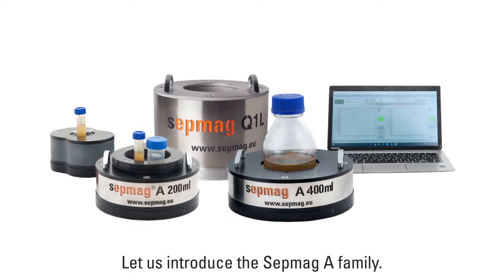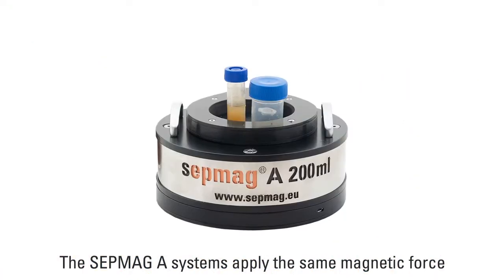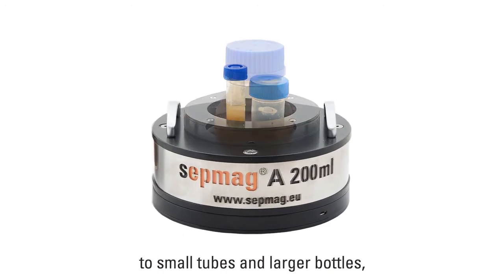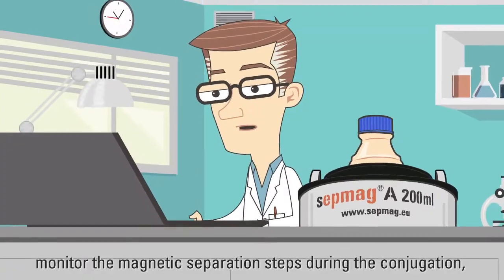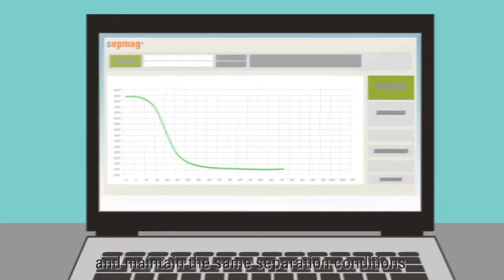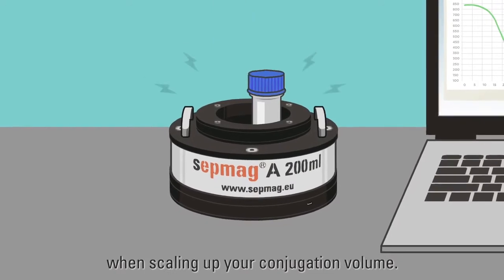Let us introduce the SEPMAG A family. The SEPMAG A systems apply the same magnetic force to small tubes and larger bottles. Monitor the magnetic separation steps during the conjugation, and maintain the same separation conditions when scaling up your conjugation volume.